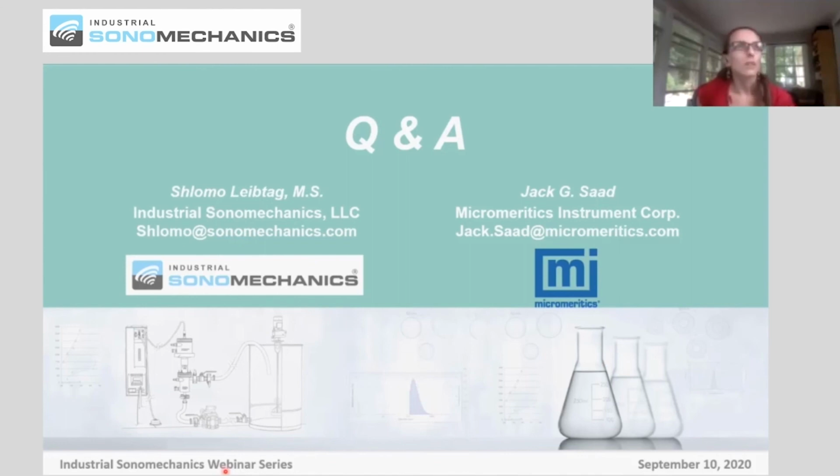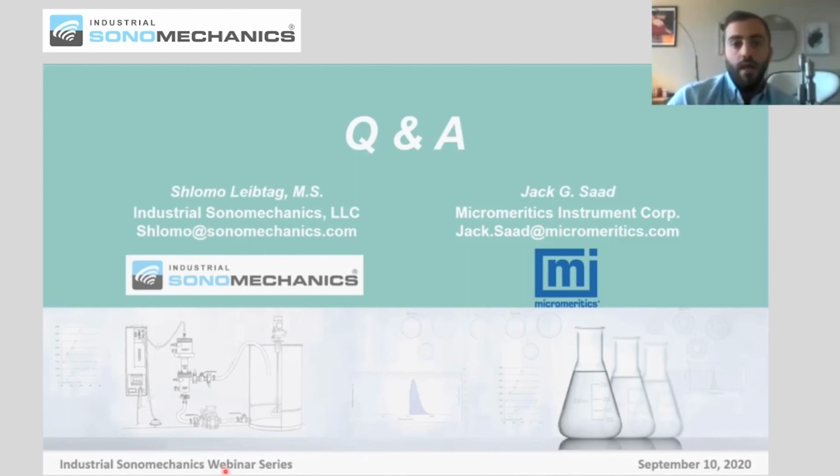And I think we have a little bit more time for a couple more questions. One of them is, is there anything unique with olive oil in your formulation? Will other oils work for making nanoemulsions? Yeah, plenty of oils can be used as carrier oils. We just demonstrated olive oil for these studies. But for instance, in the lycopene studies, we used coconut oil as a carrier oil.